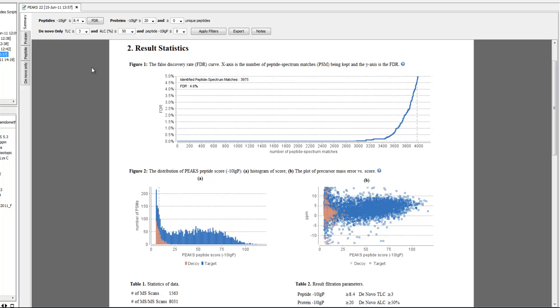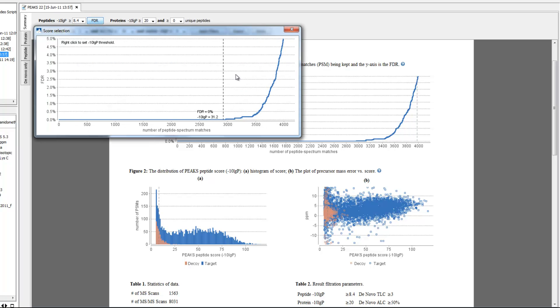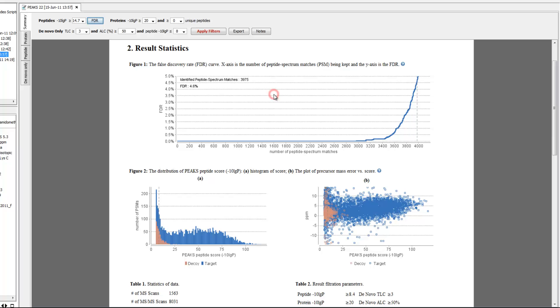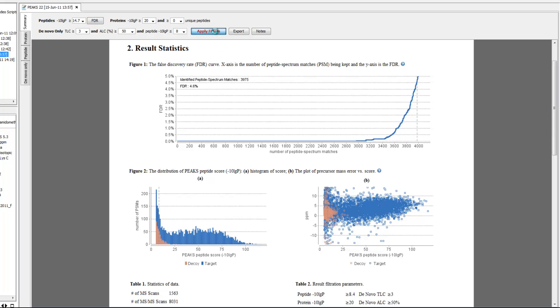In the first tab of the results, PEAKS summarizes the results in an easy-to-read summary view. The result view is the central place for result filtration and validation. The specification of a filter is as simple as clicking this FDR button, selecting the false discovery rate on this FDR curve, and clicking the apply filter button. The result statistics are then updated dynamically.